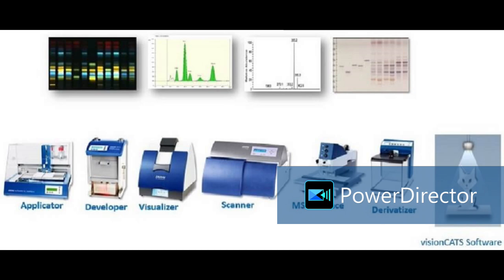But the scanner is the heart of the HPTLC system, and it is very good for detection. It is acting as the detector in HPTLC, and by using the scanner you can generate spectra and match with the library. You can do quantitative analysis, quantification, and these two are very important, qualitative and quantitative. Spectral match is qualitative analysis, whether it is there or not. Okay, if diazepam is found, its spectrum will match with the spectral library, so you can report that diazepam is detected in the visceral sample, and you can show this match of spectra.